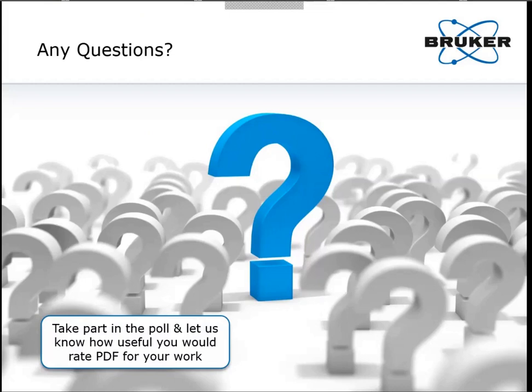We would have liked to have shown an organic example, but of course we're a little bit limited in time, so we focused only on these other examples. But certainly, yes, you can measure organic materials with PDF as well. And I think the good thing is you can actually use quite a big capillary, so you get a lot of sample in the beam, you get good intensities, even if your sample is rather weakly absorbing. That's true, yeah. Because the organic materials are very weakly scattering, but you can use a lot of material, so that kind of will help that point a bit.